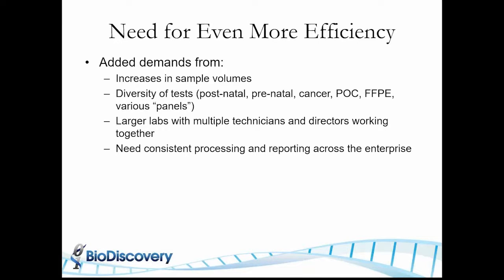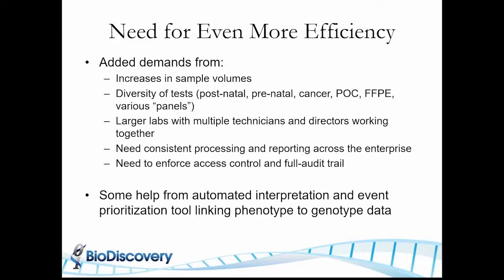And one of the most important parts in a clinical lab workflow, as the technology has matured and is moving away from being more of a research tool, a clinical lab requires consistency in reporting and processing across the entire enterprise. So that improves efficiency and quality, and that's a high demand. And as regulations are being more and more introduced, trackability, full audit trail, and access control has become more of a need as well.